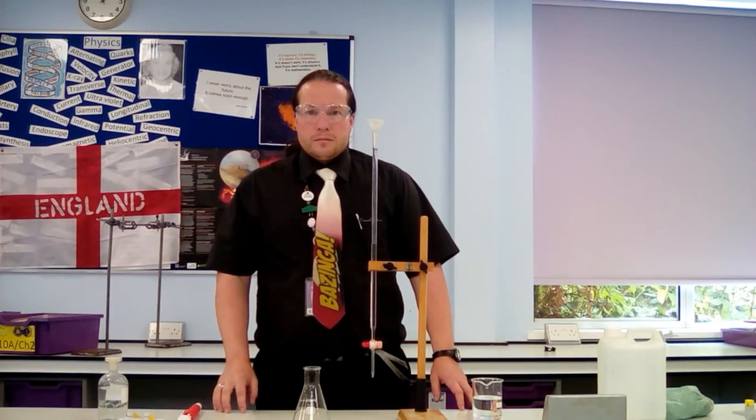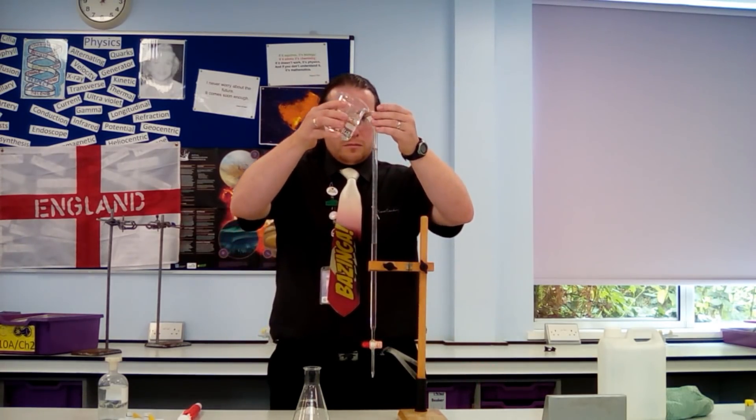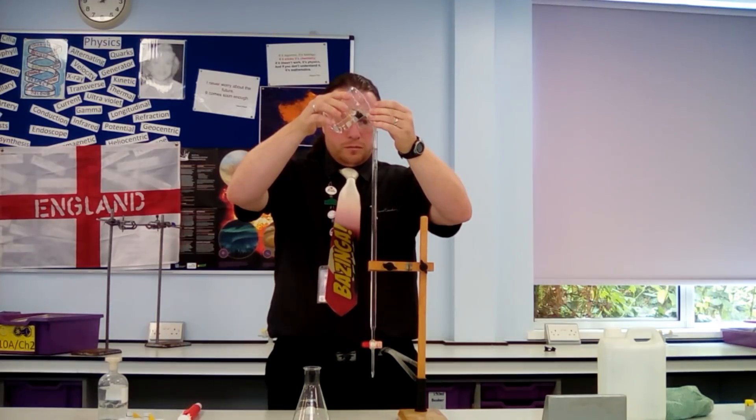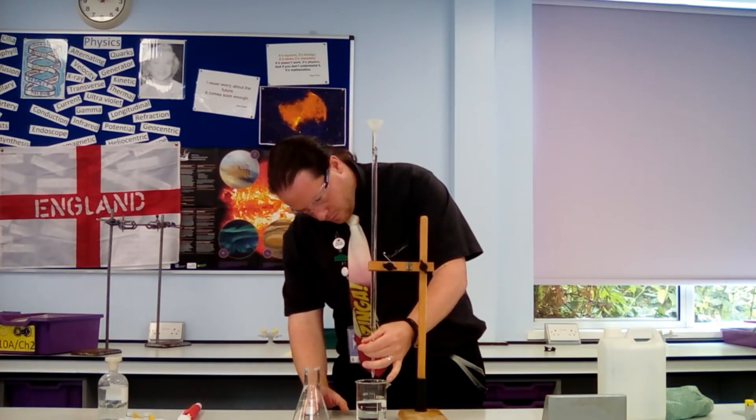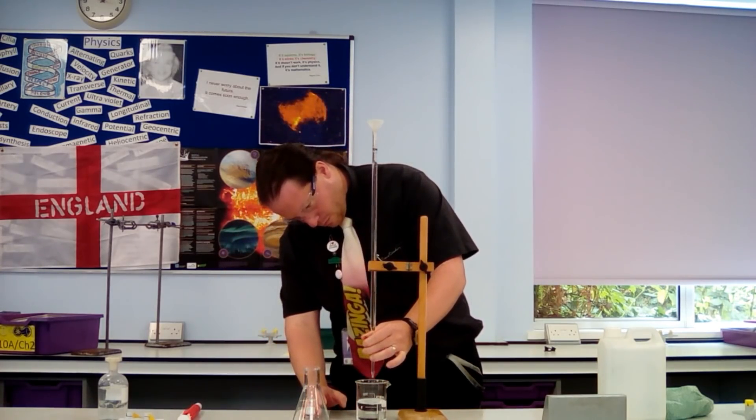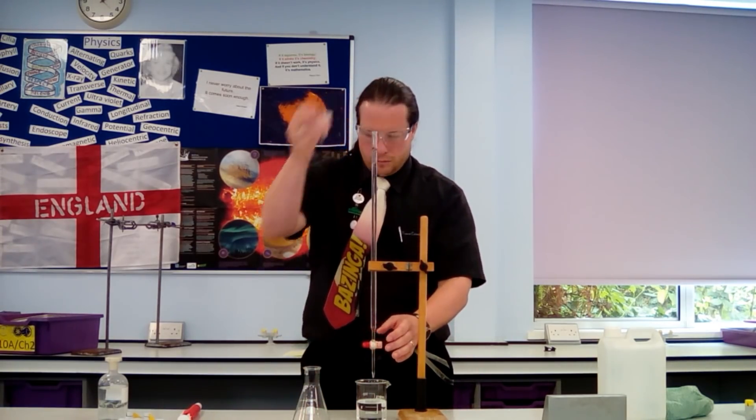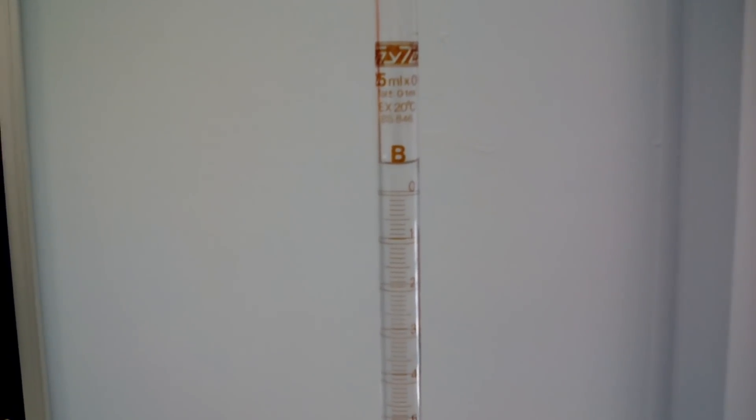We can now add the sulfuric acid to the burette. We've got a small funnel in the top of the burette to aid pouring in. Once the sulfuric acid has reached above the zero line, we can put the beaker below the burette. Now we can drain out the excess sulfuric acid, but first you must remember to take the funnel out of the top.